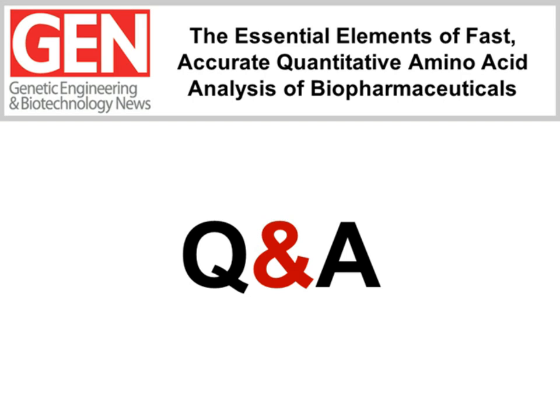We've put more emphasis in our development and in our evaluation on using samples where we can know what the right answer is and therefore compare how closely we approach the true answer.